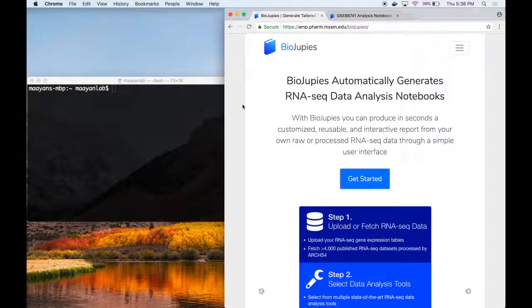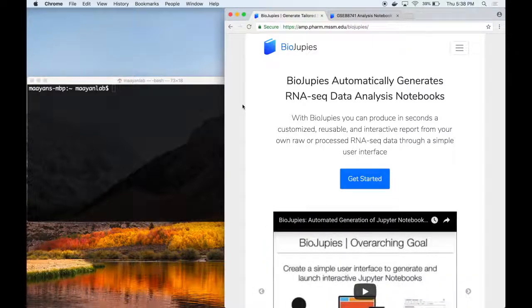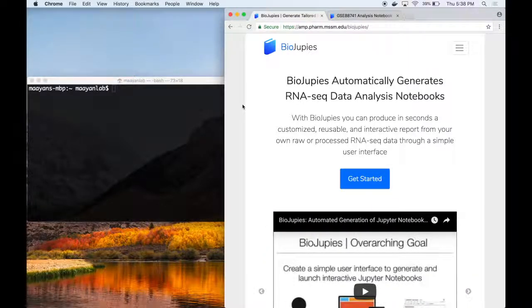In this video, we will show how a user can download, execute, and customize any Jupyter notebook generated using BioJupees on their local computer.